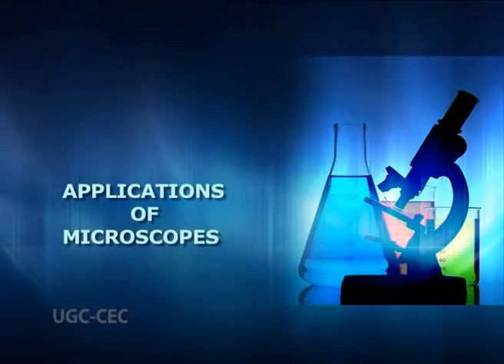Applications of microscopes. Applications of microscopes are enormous. Remember, the type of microscope is selected based upon its uses and our purpose. To know the applications, it is mandatory to divide applications into sectors, for instance, applications in biological sciences and non-biological sciences, which include physical, chemical, material, or mathematical science.